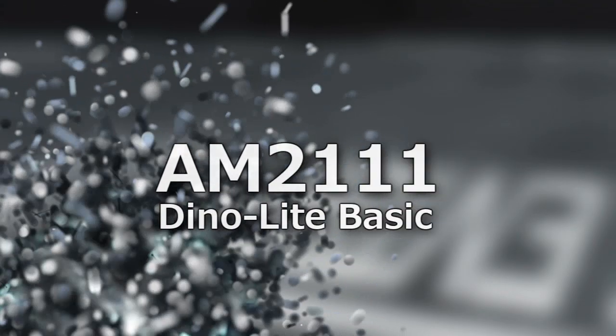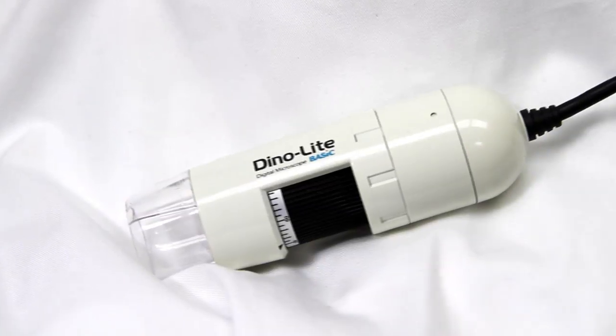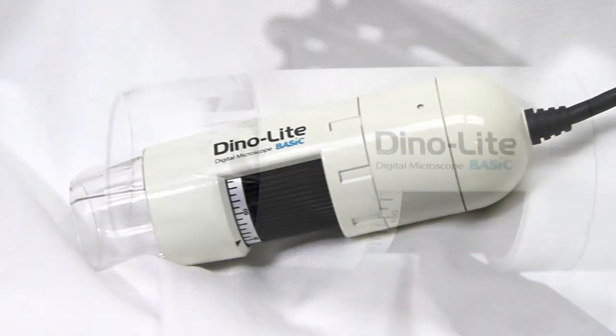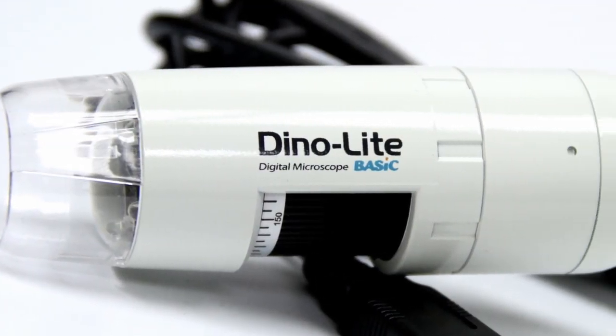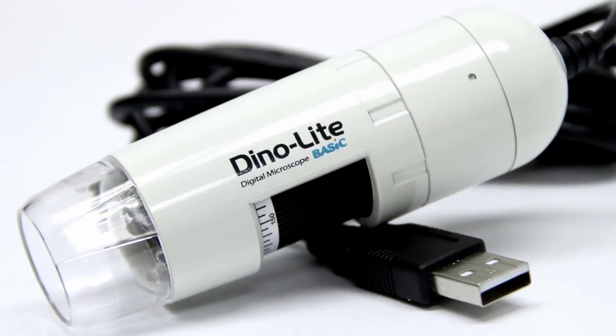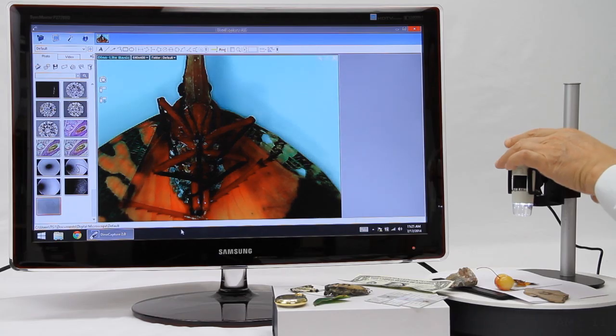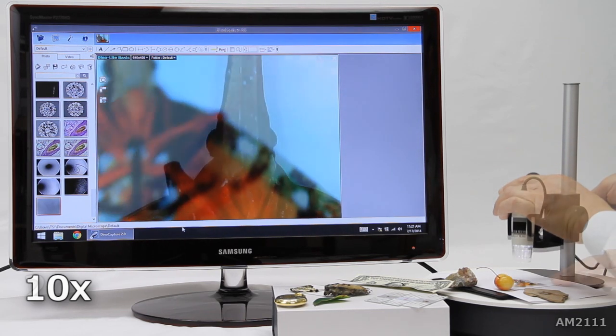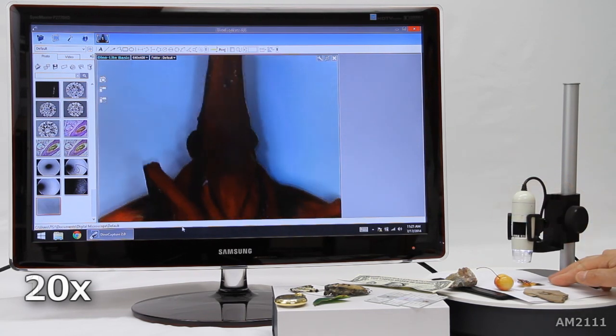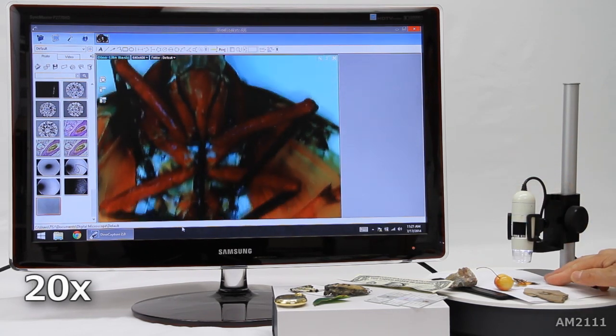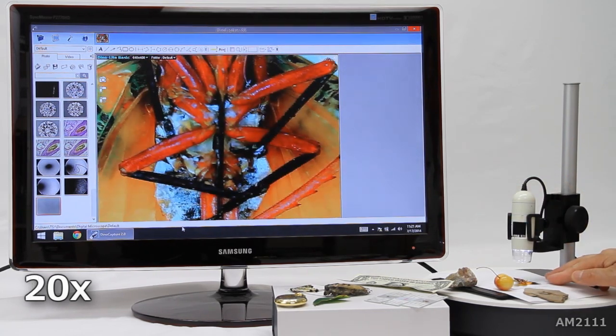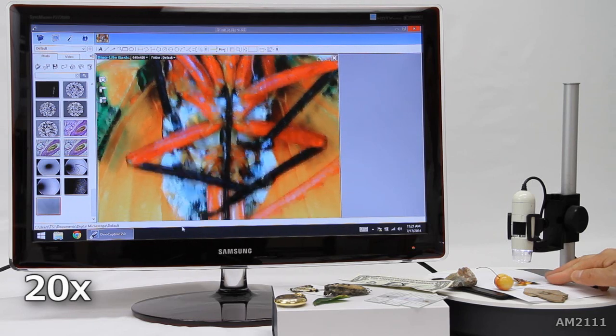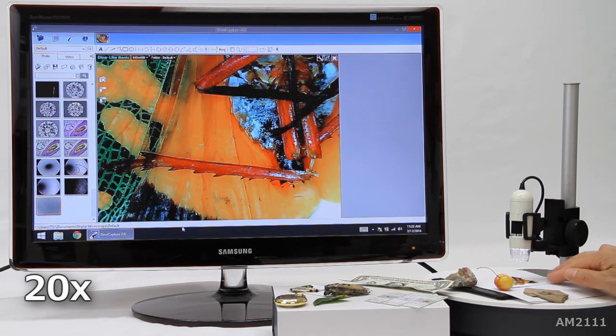This is the AM2111 DynoLite basic handheld microscope camera. This is an easy to use DynoLite model with a magnification range of 10 to 230 times depending on the distance.